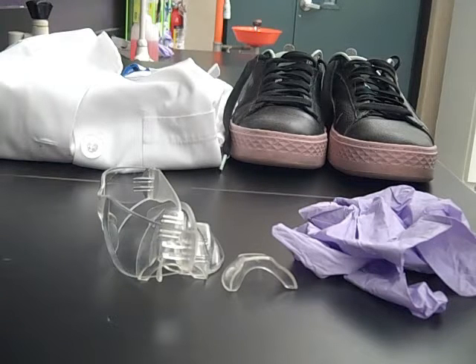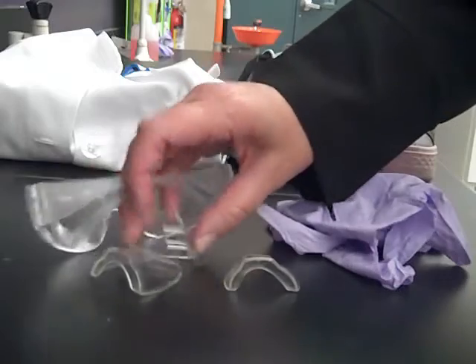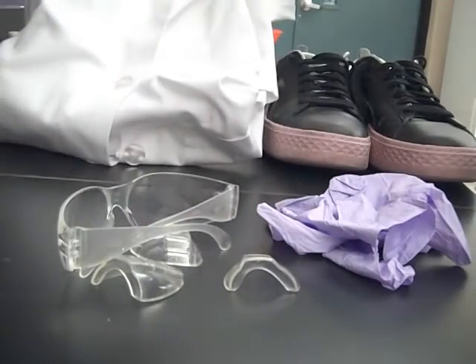In the microbiology lab there are four things we wear to protect ourselves from the microorganisms we are working with. You have to wear gloves, eye protection, compliant shoes, and a lab coat.